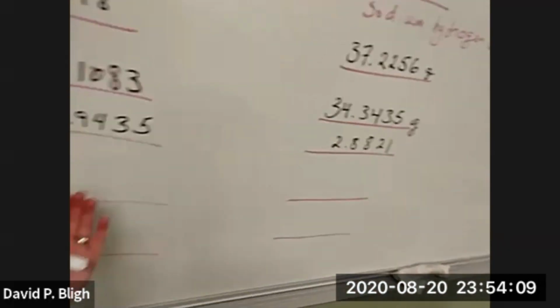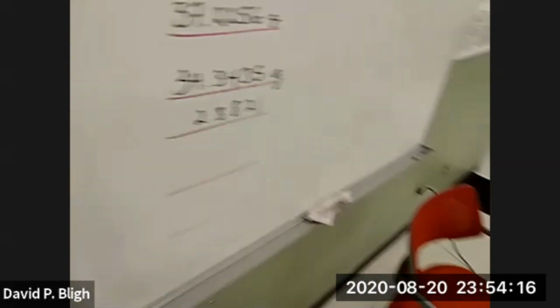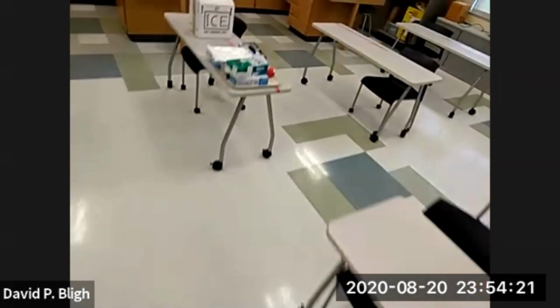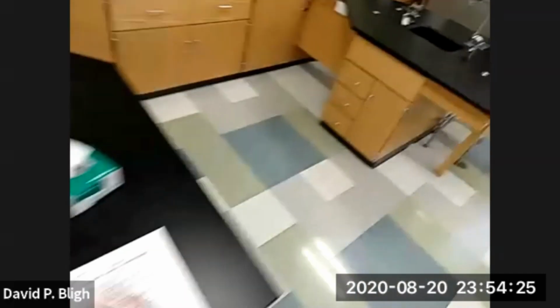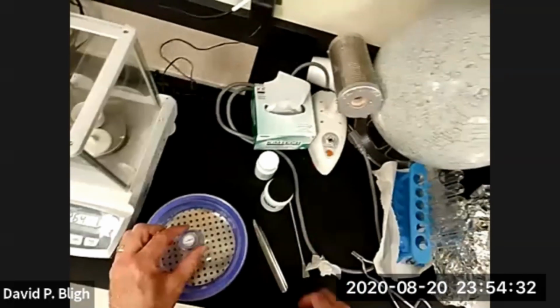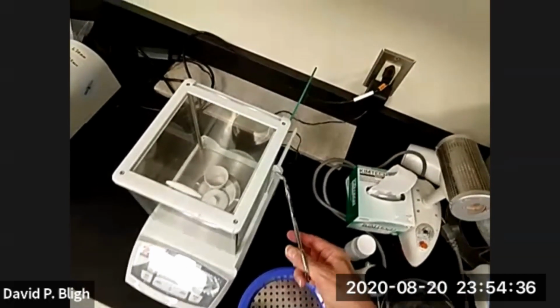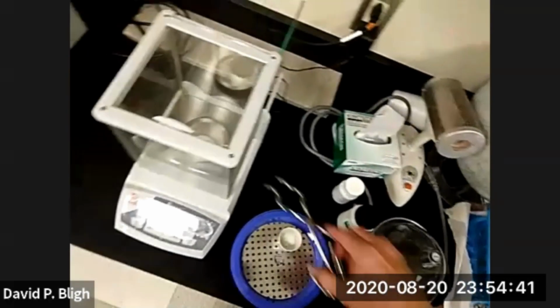Well, we're heating this one already. And then after that one's done, we'll heat this one up and weigh them again. Okay. That heating is about done. So while we're waiting for it to finish, we'll go ahead and move this one for carrying purposes over here.